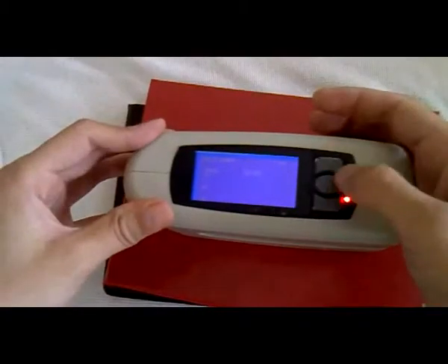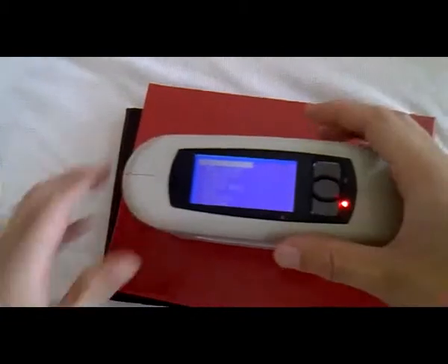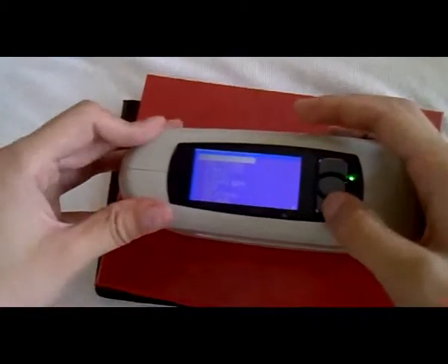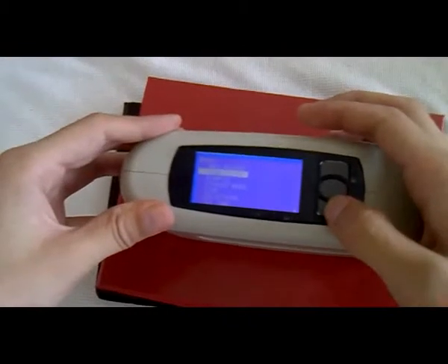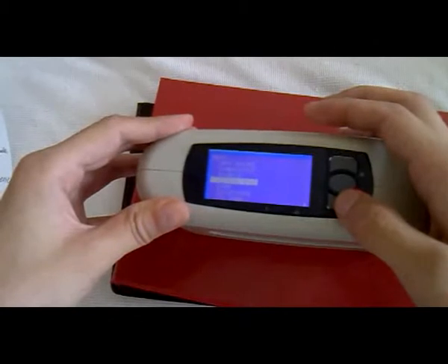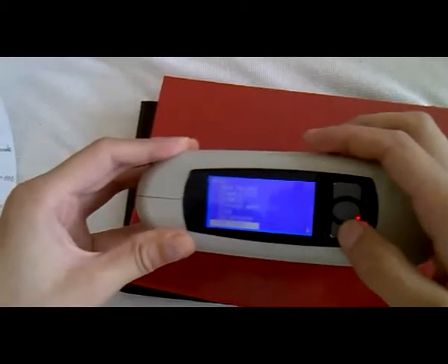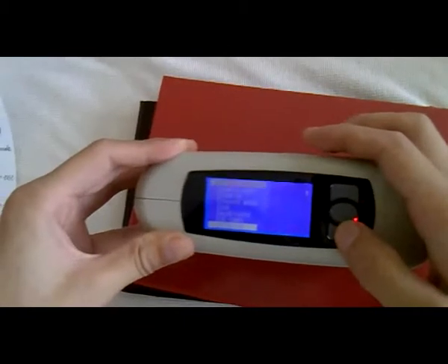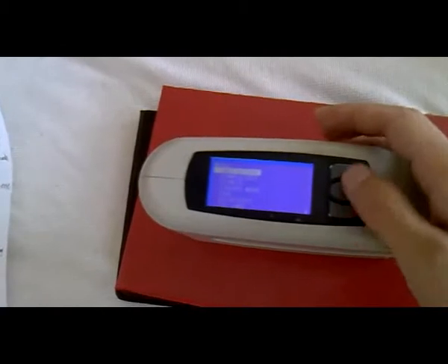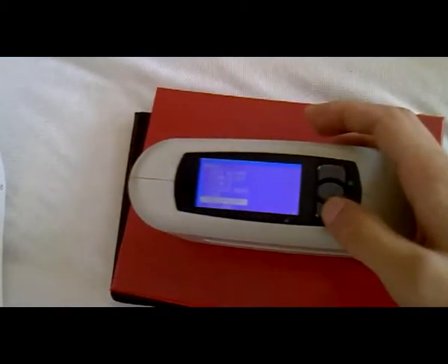When we press the menu key, we will see all the functions. For example: measure record, simple and different, config, choose mode, USB, Bluetooth, SD card, version.